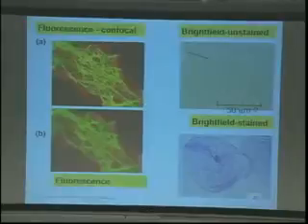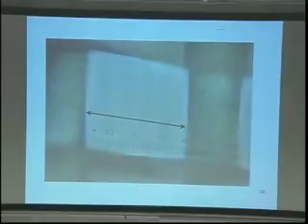Now I made a video that I will try to show you. Hopefully it's going to work. Anyway, we want to get nice sharp lines. That means you position it, and then you open it till it just fills the field of view. Now this is a rectangular image, so I can't illustrate it properly. If I had a circular image there, you could see it, but when you look, it's circular. This just shows you the calibration with more resolution, better ability to see that. You can figure out which one's on top, which one's on the bottom.